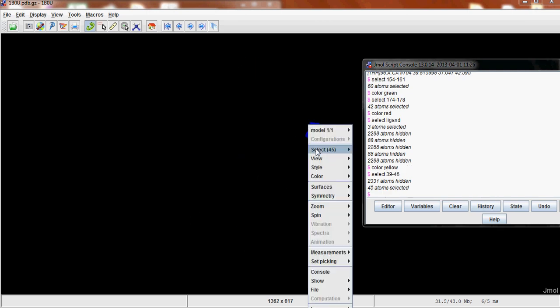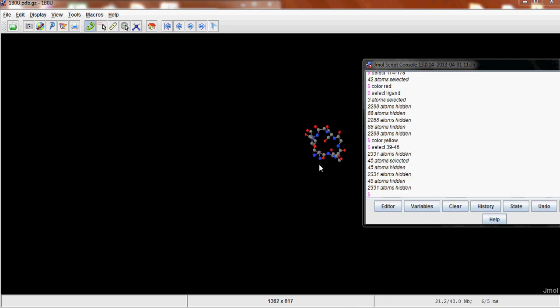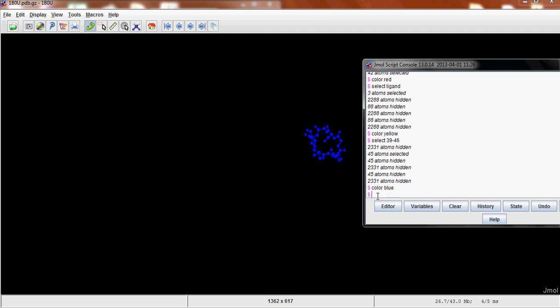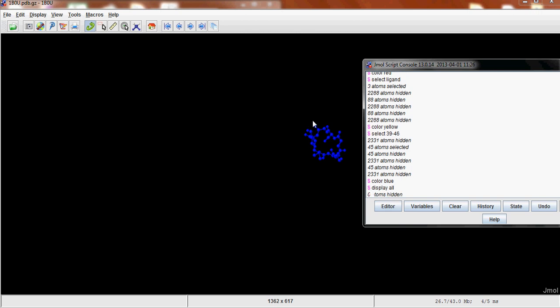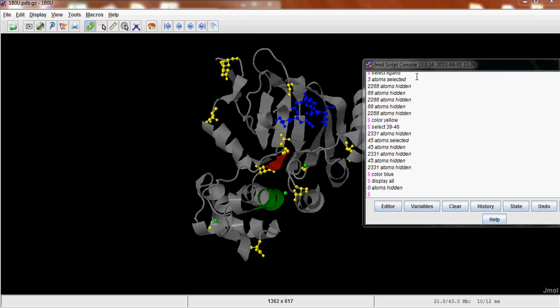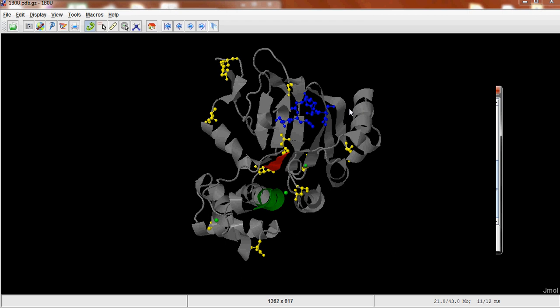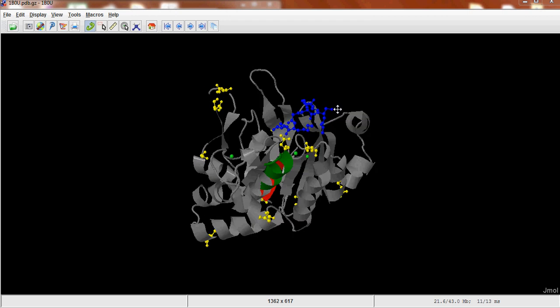So again, you right click, go into Style, Scheme, Ball and Stick. And you can give it its color back because it loses it when you change the style. And then Display All.